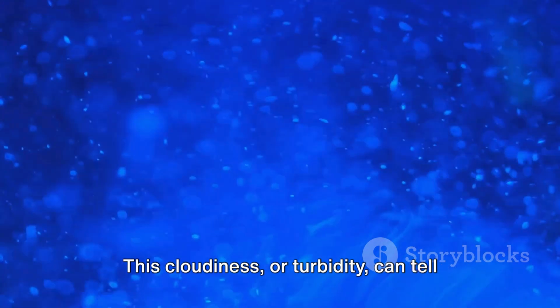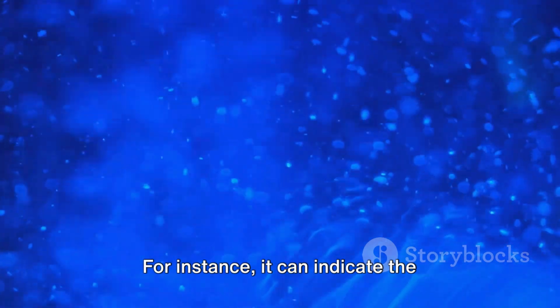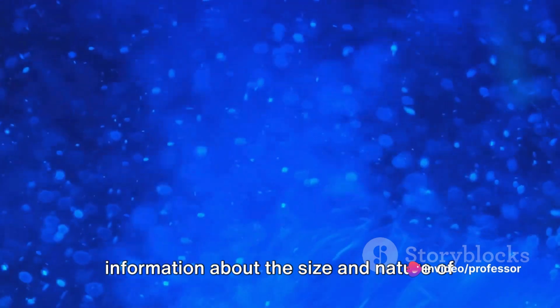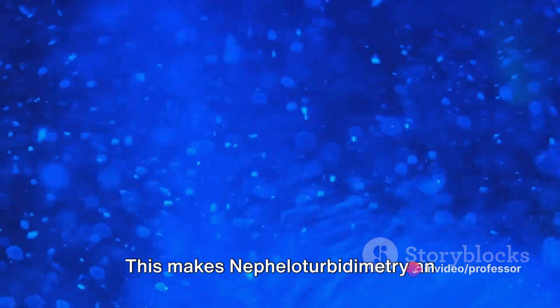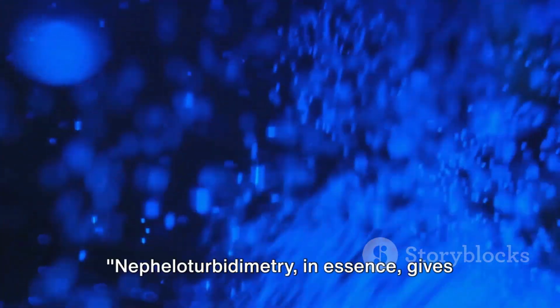This cloudiness or turbidity can tell us a lot about the sample. For instance, it can indicate the presence of impurities, or it can provide information about the size and nature of the particles in the sample. This makes Nepheloturbidimetry an invaluable tool in many scientific and industrial fields.